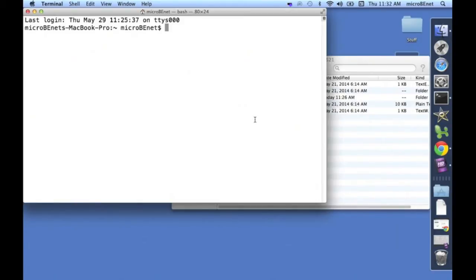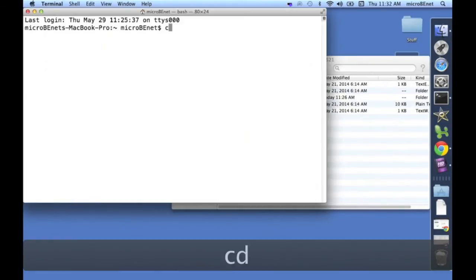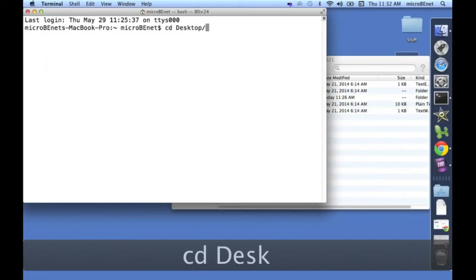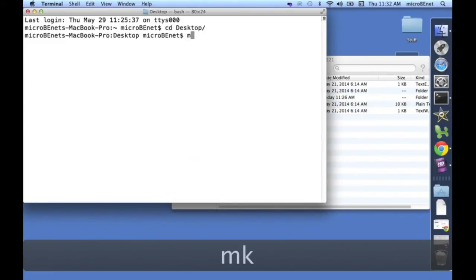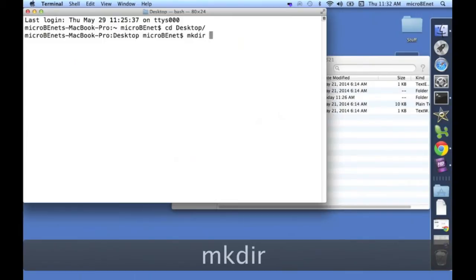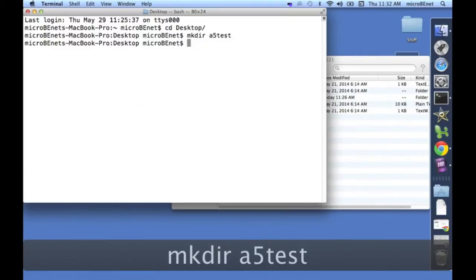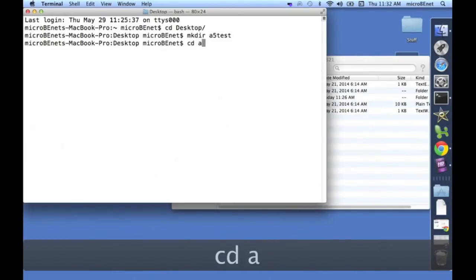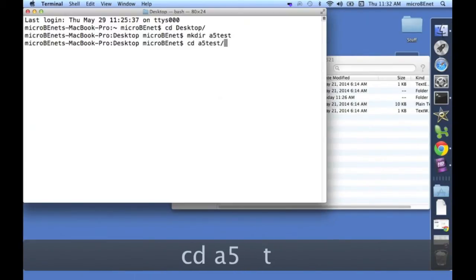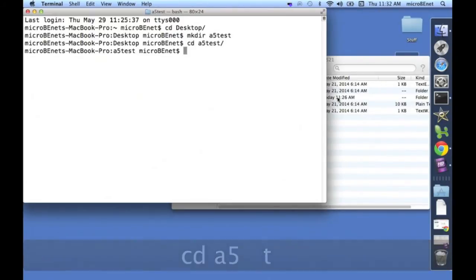And let's navigate to somewhere and make a directory. Wherever you run A5 from is where all the files will occur. So I'm going to make a new folder called A5-Test on my desktop. I'm going to navigate into that folder.